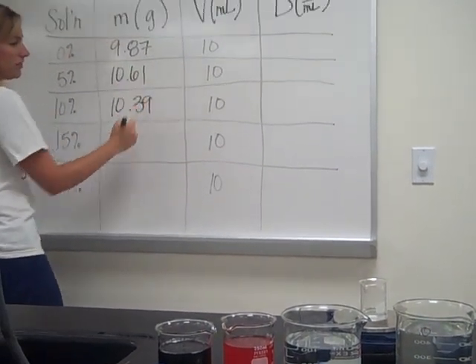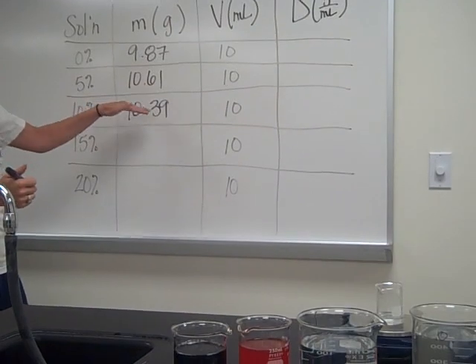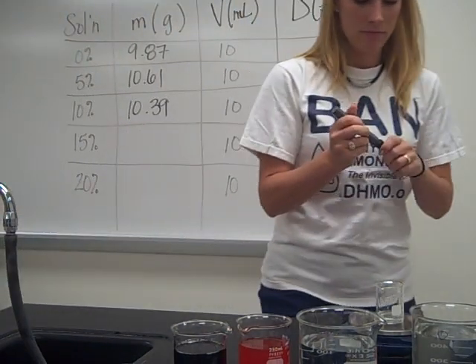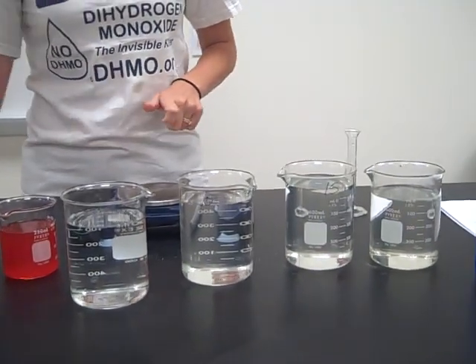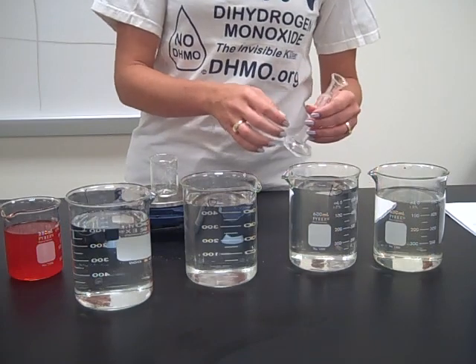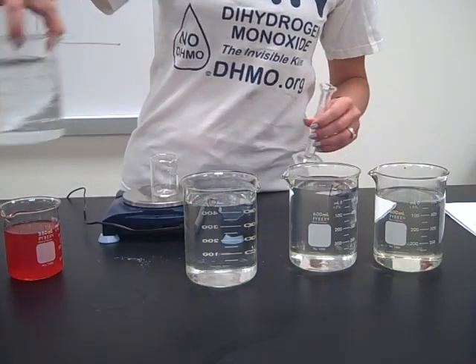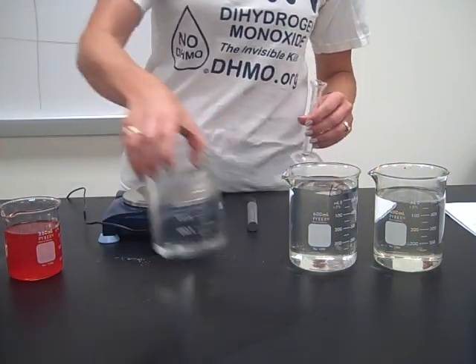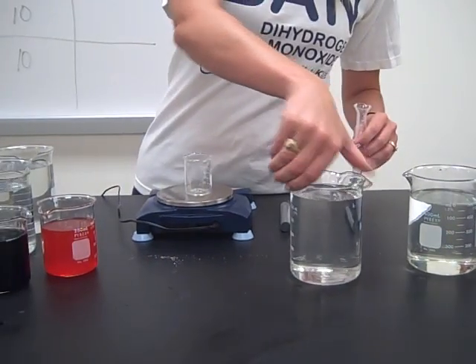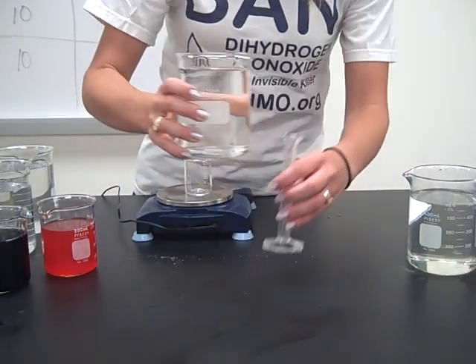This is a little bit of an anomaly here. My mass should have continued to go up. I'm thinking I must have overshot this volume. That's why we get lots of points whenever we're going to be making a line graph — so that if we do have an outlier, something where maybe our lab technique wasn't as great as it should have been, it doesn't skew our results too badly.